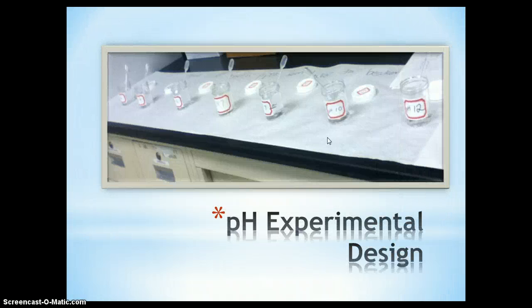What we did here was we labeled 7 test tubes, 1 through 7. We added 1 milliliter of one of the pHs to each tube. For example, test tube 1 had a pH of 2, so we would add 1 milliliter of the pH 2 into test tube 1, and then do the same for the other remaining tubes with their designated pH.